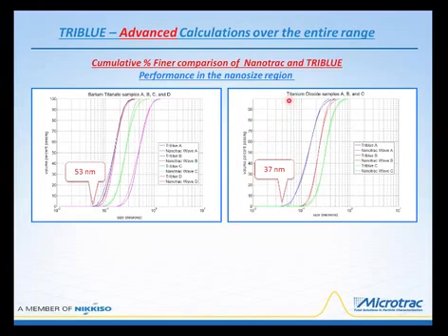Over here on the right-hand side, we have titanium dioxide, and this is the big component that provides for white paint, and other colors and pigments are added typically to a titanium dioxide suspension in the paint can to achieve the colors that are desired. And we have 3 samples of titanium dioxide here. And again, you can see how the instrument responds and picks up these particles going all the way down to about 35, 37 nanometers. And it clearly distinguishes between the 3 different materials. But at the same time, the Nanotrac data and the wave data are virtually identical.